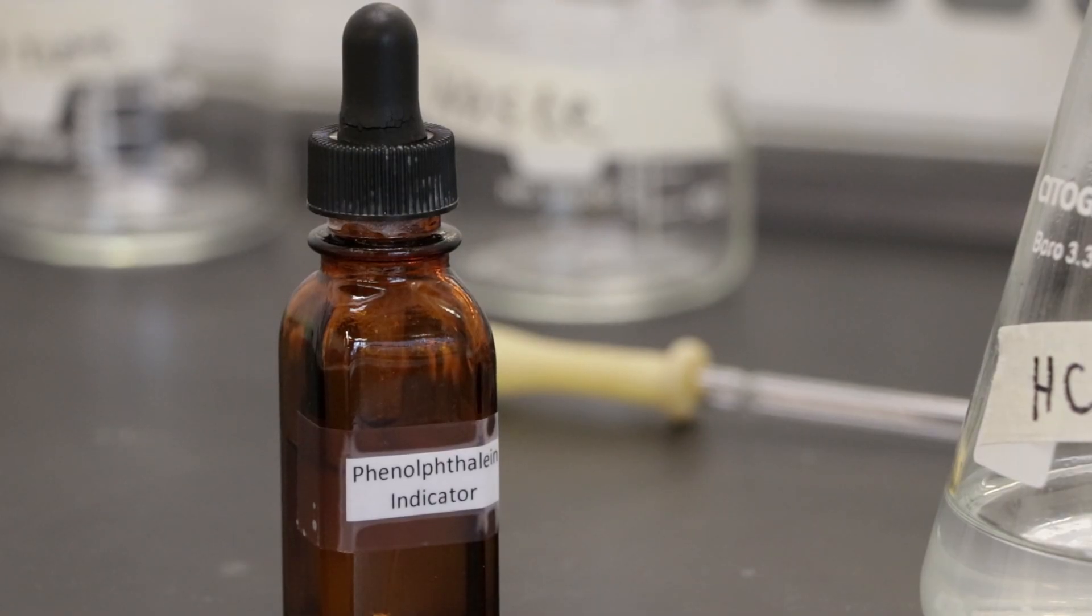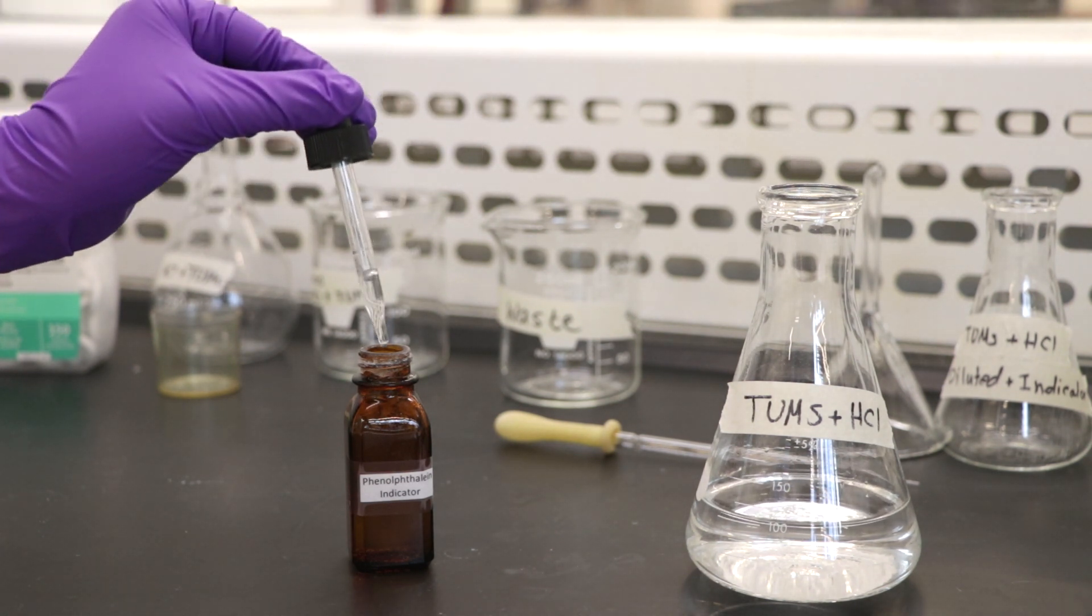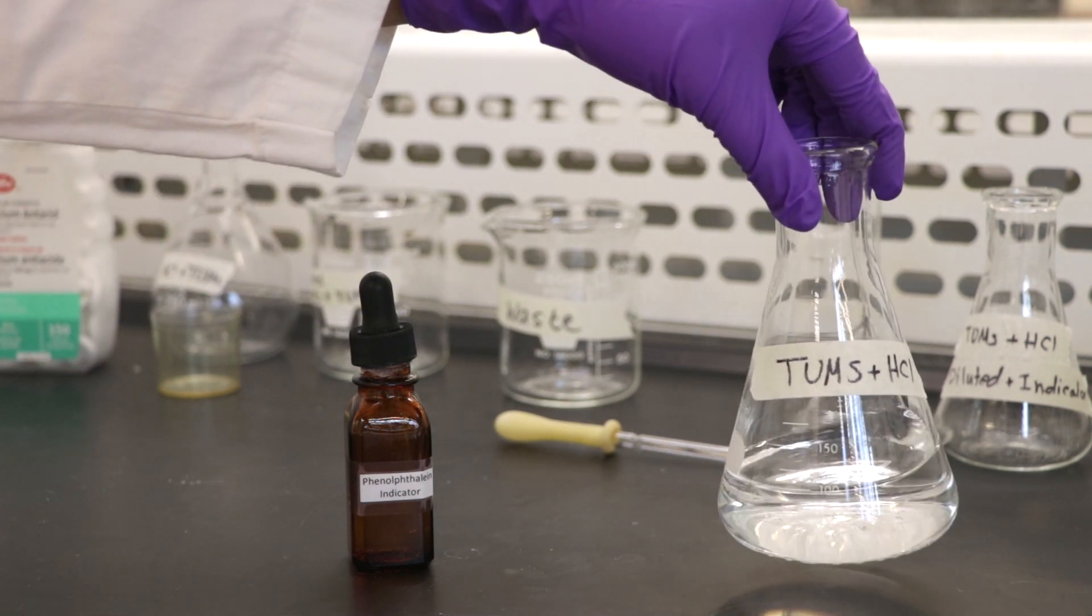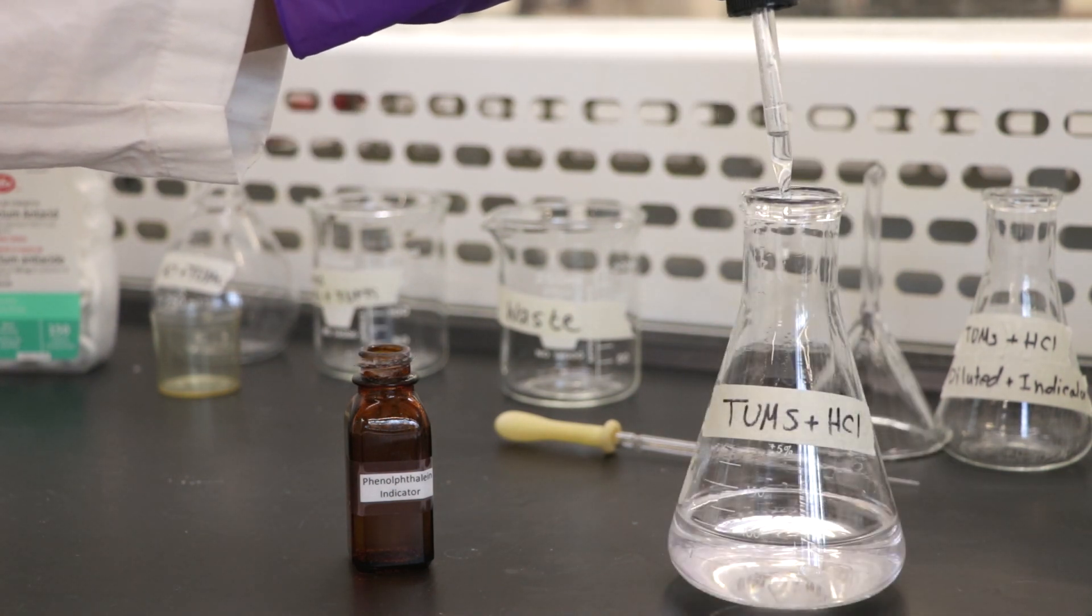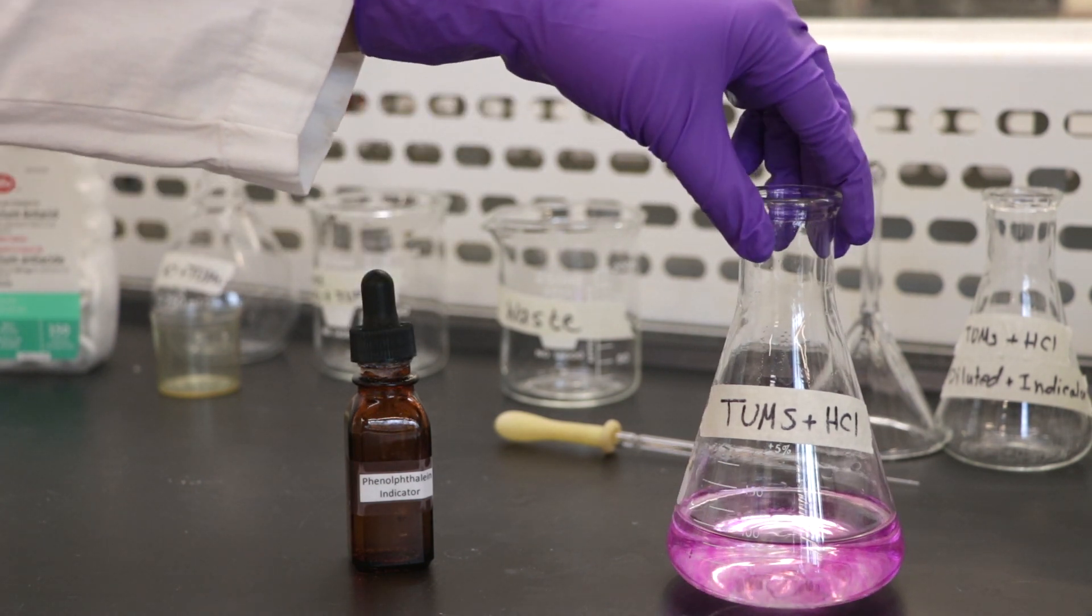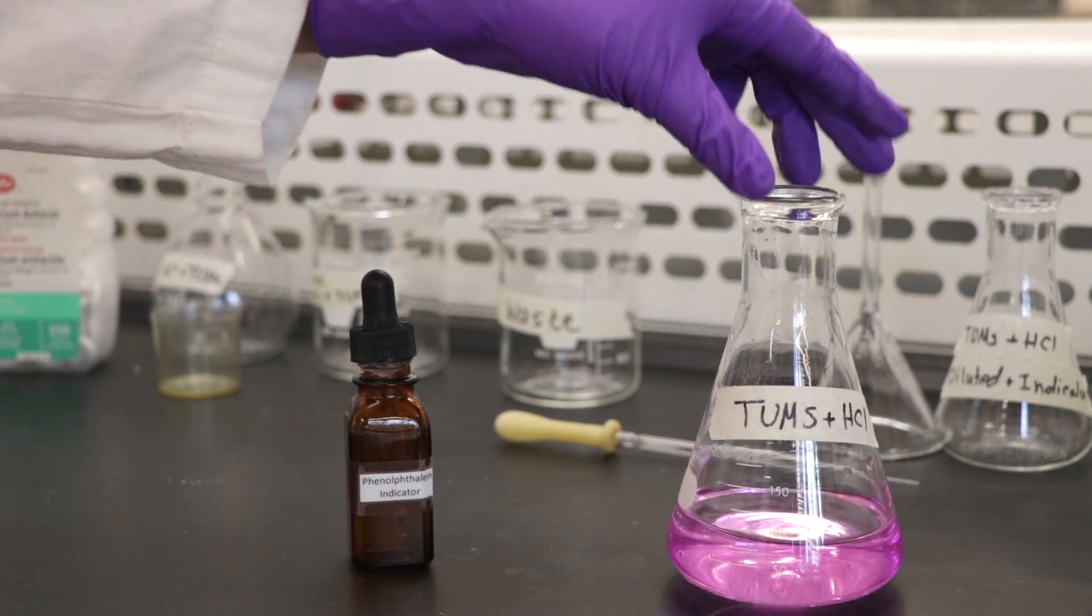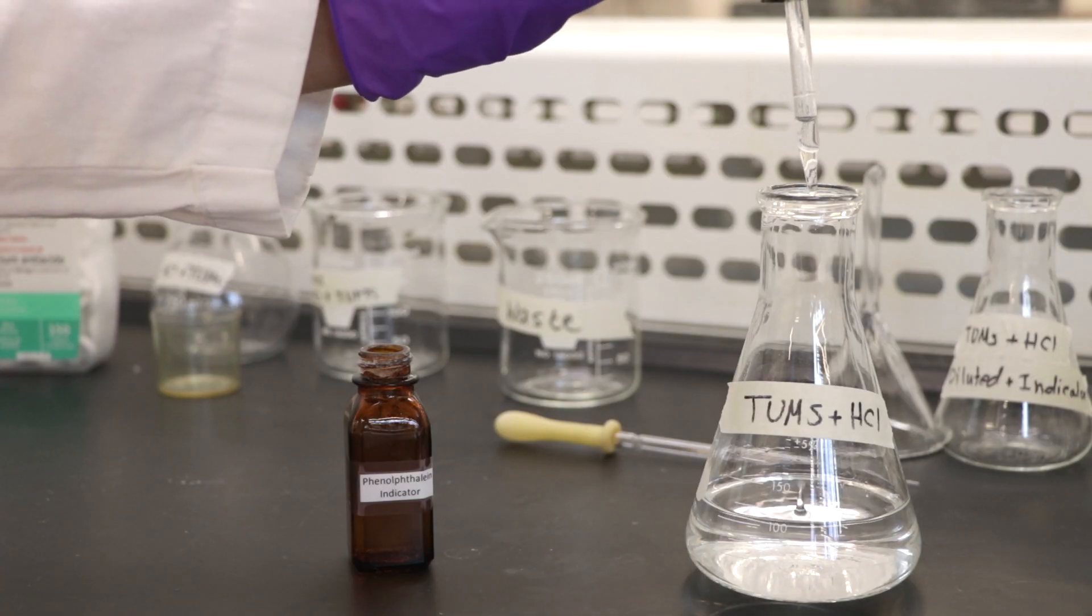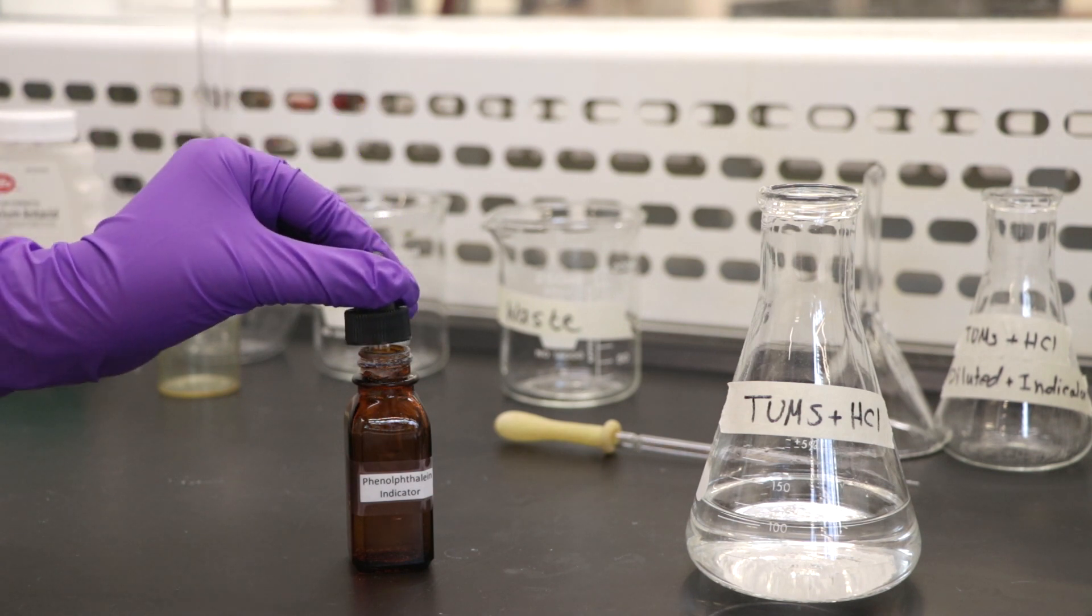Add three to four drops of phenolphthalein indicator. If the solution stays clear, then proceed with the next step of the experiment. However, if the solution turns pink, then add 25 milliliters of stock HCl and swirl. Make sure you record how much HCl you have added. Place it on the hot plate again and bring it to a boil. Add three to four drops of the indicator. If the solution stays white, then proceed to the next step. If the solution turns pink, then repeat this process again.